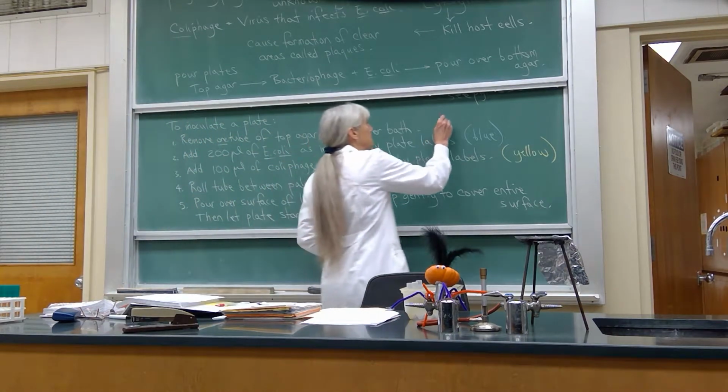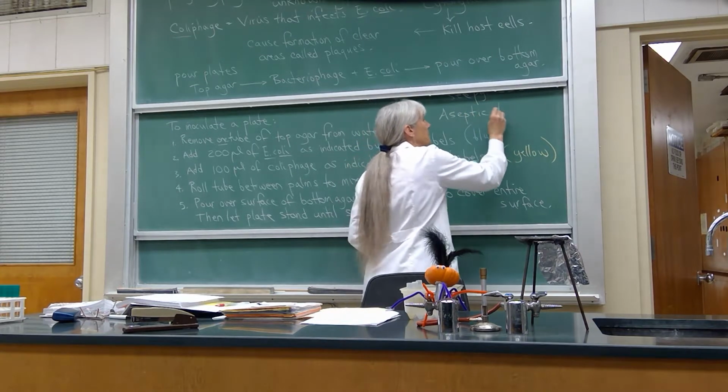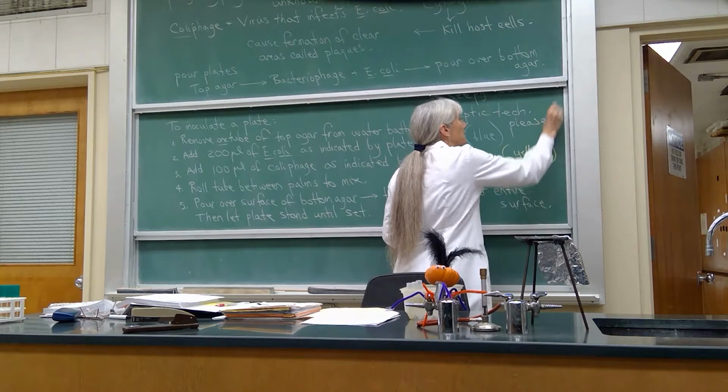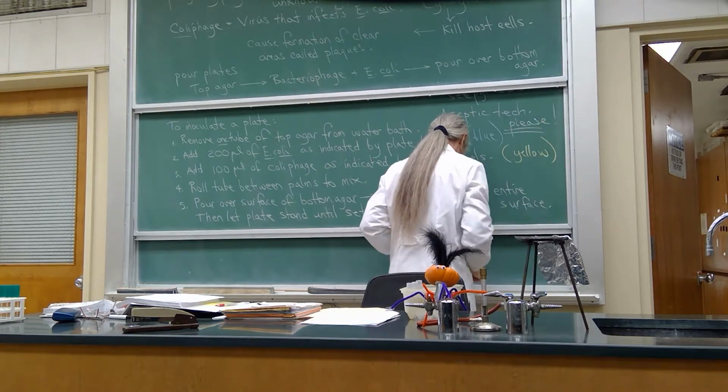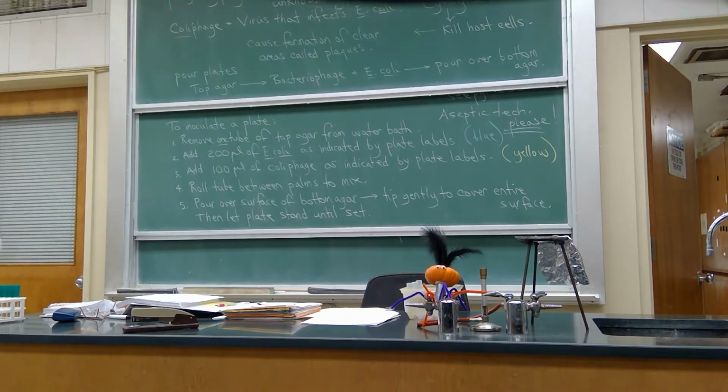So yes, have your burners going. Your plates are labeled, they tell you exactly what goes on there. You guys should be able to do this.